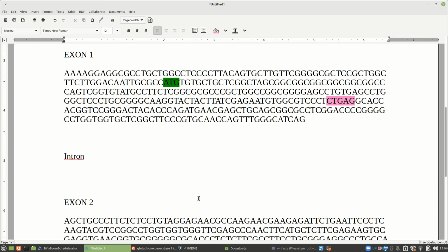Now, how do you find the intron again? Well, go search for this, and go search for this, and pull out the pieces in between and place it in the intron. Now, there are rules for the intron. Once you find this, you find the closest thing you can to the rules. So you read the rules, and once you have the intron placed in here, then you just look at where it says you should look. You know where the splice site is. You've got that. And you look in this area for the splicing signals. All right, you look for anything, the closest thing you can find.